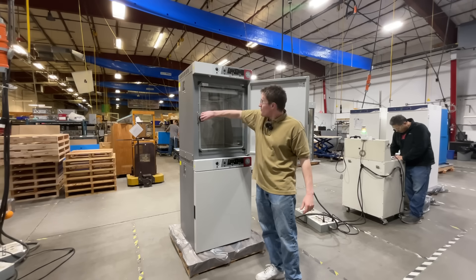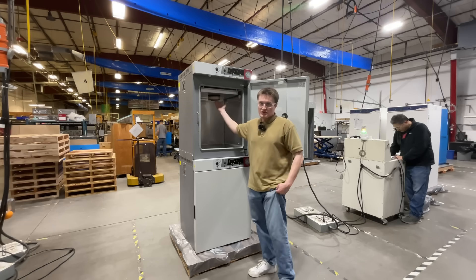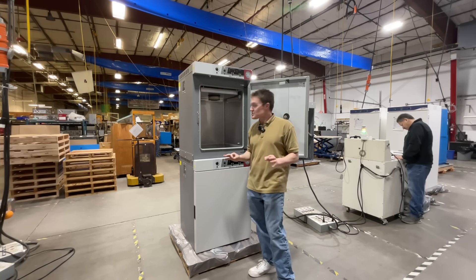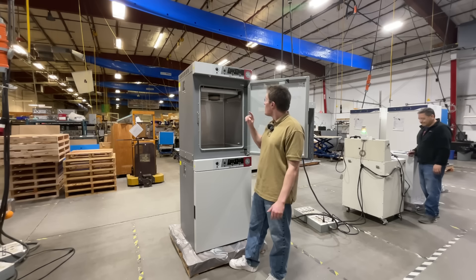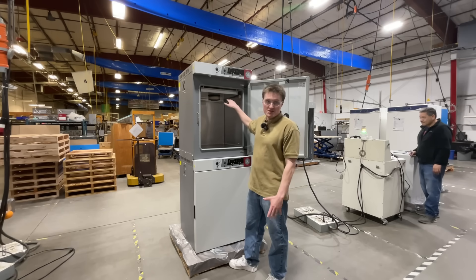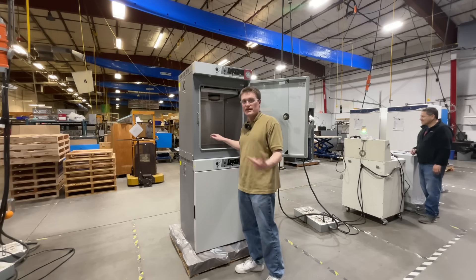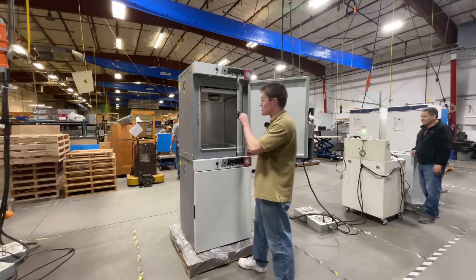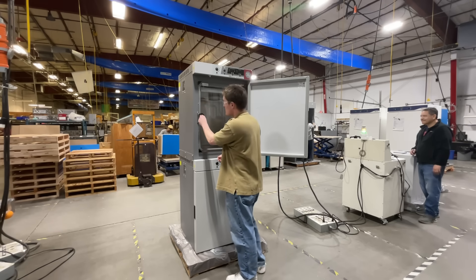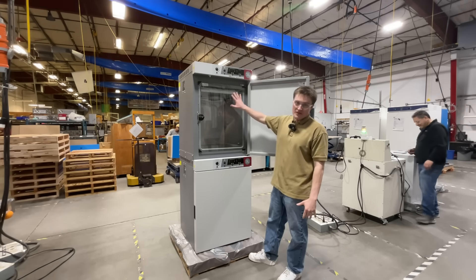Opening up the inner glass door, we see a couple things. First, our custom HEPA filter — this provides excellent ISO cleanroom status within the workspace. There is room for three shelves included within each unit, as well as a water pan to increase humidity inside the chamber. Given the fact that these are used in high humidity environments, we have taken extra steps to prevent condensation forming on this glass door.